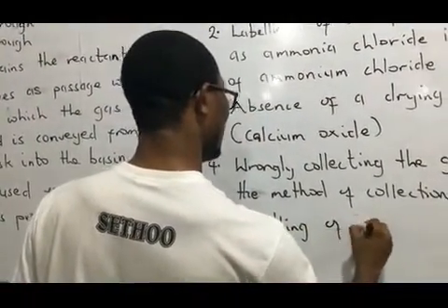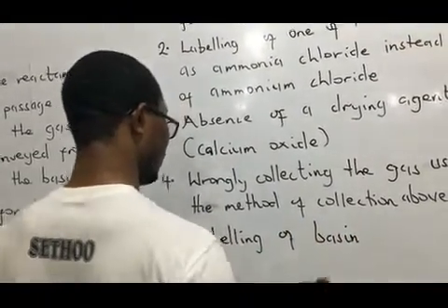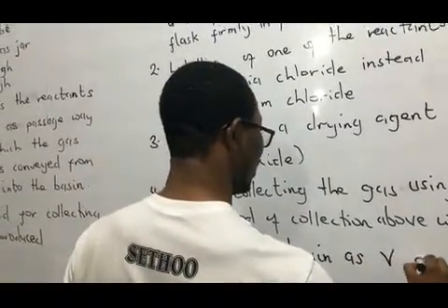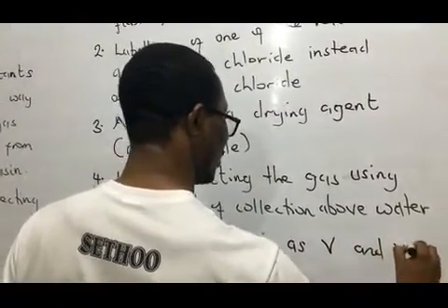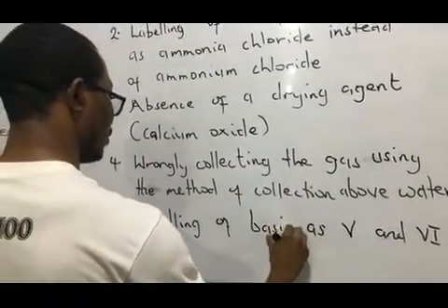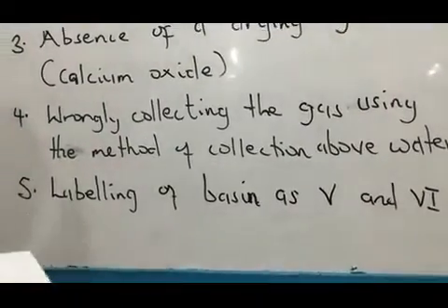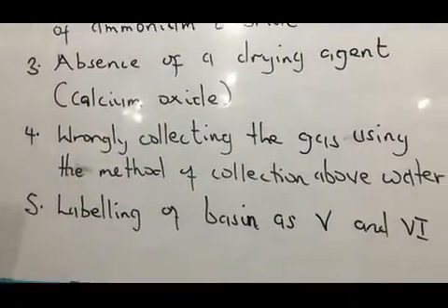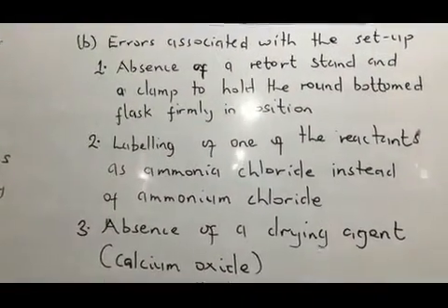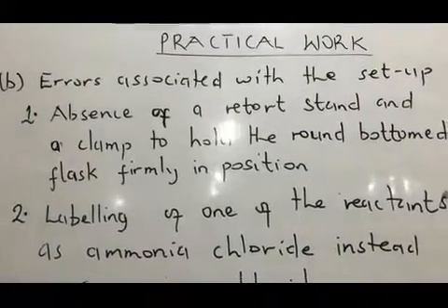Labeling of basin as V and VI. Okay, so these are some of the possible errors in the setup.